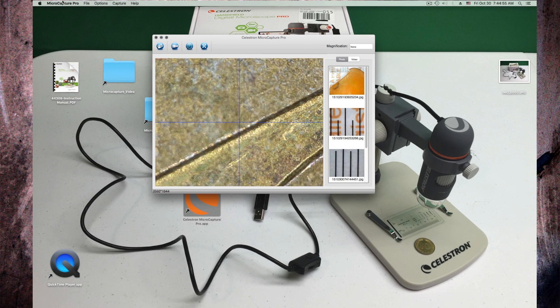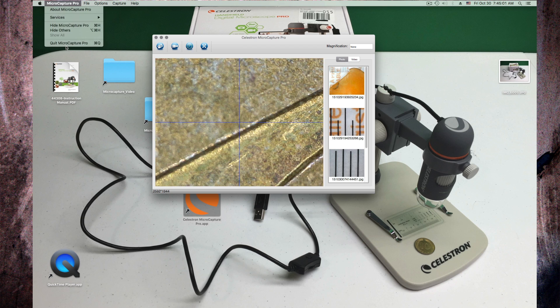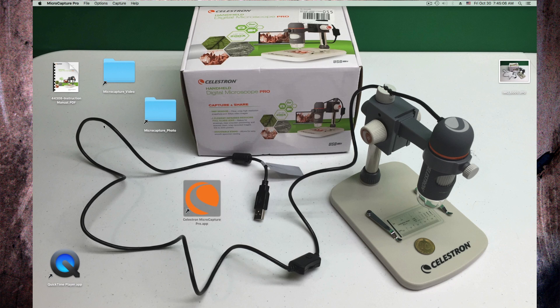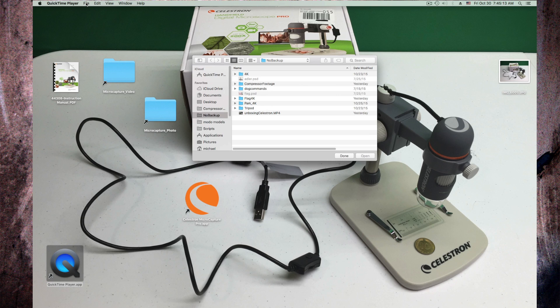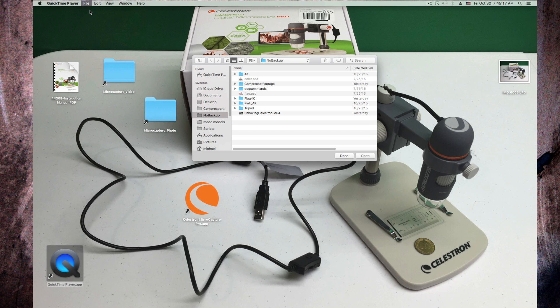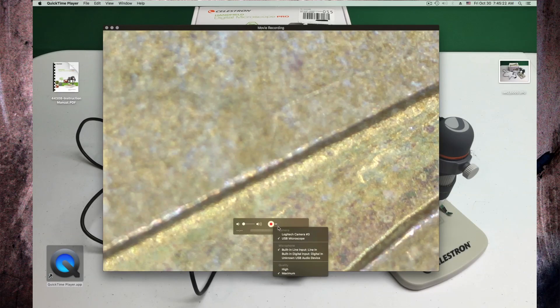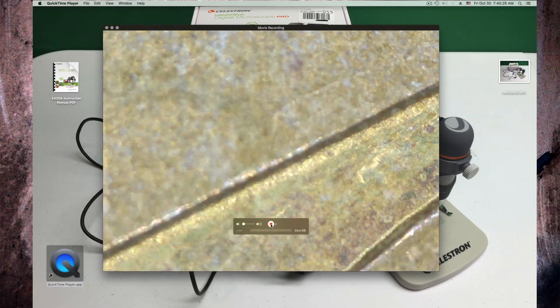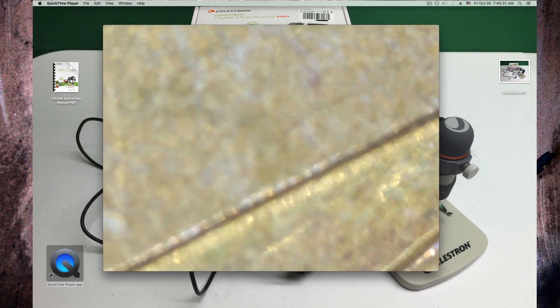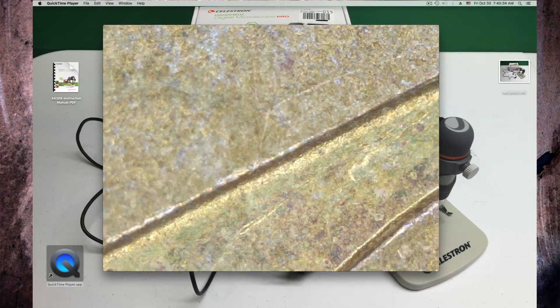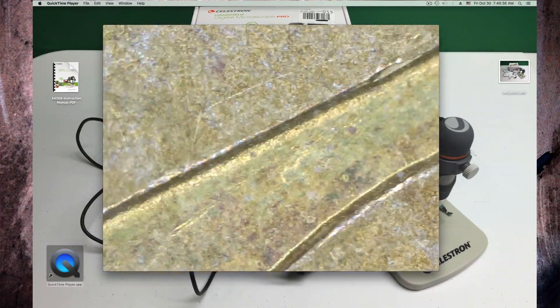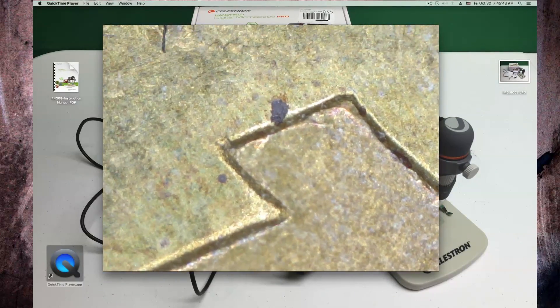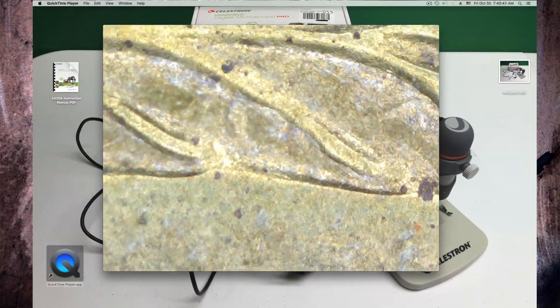If you want the faster performance, you can just cancel this. See how slow this is? And then you just use the QuickTime app. And in the QuickTime app you say, okay, new movie recording. Here. And then you select your camera selected, high quality. So this would be the movie, and when you record you see how many megabytes it spits out. Let me just have to do this here. It's a way faster performance. You see here the damage on the coin, the dirt on it, the metal.